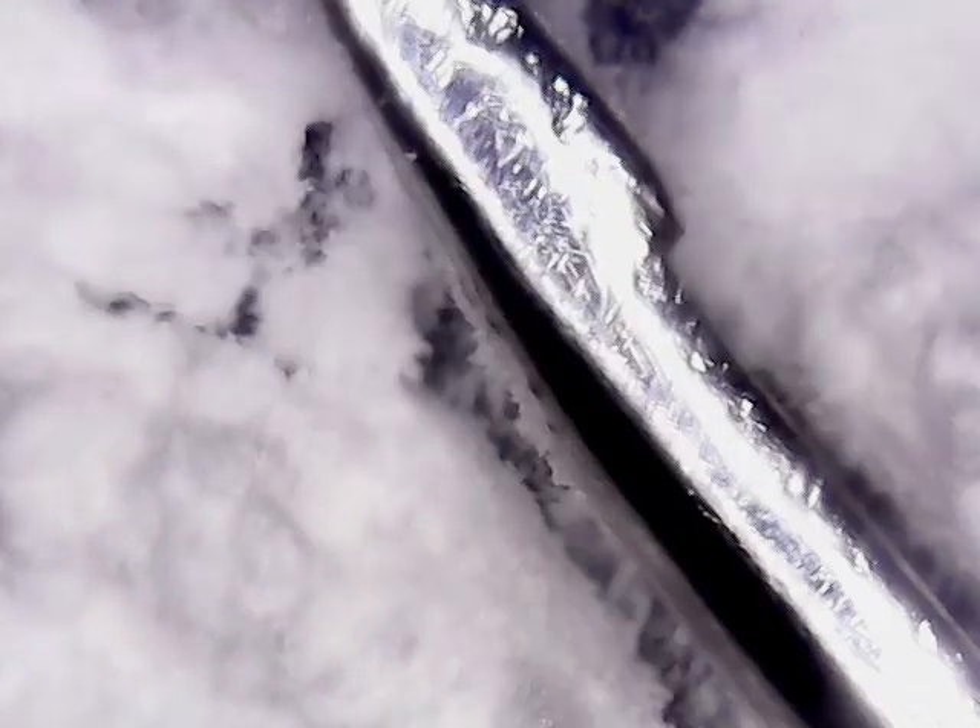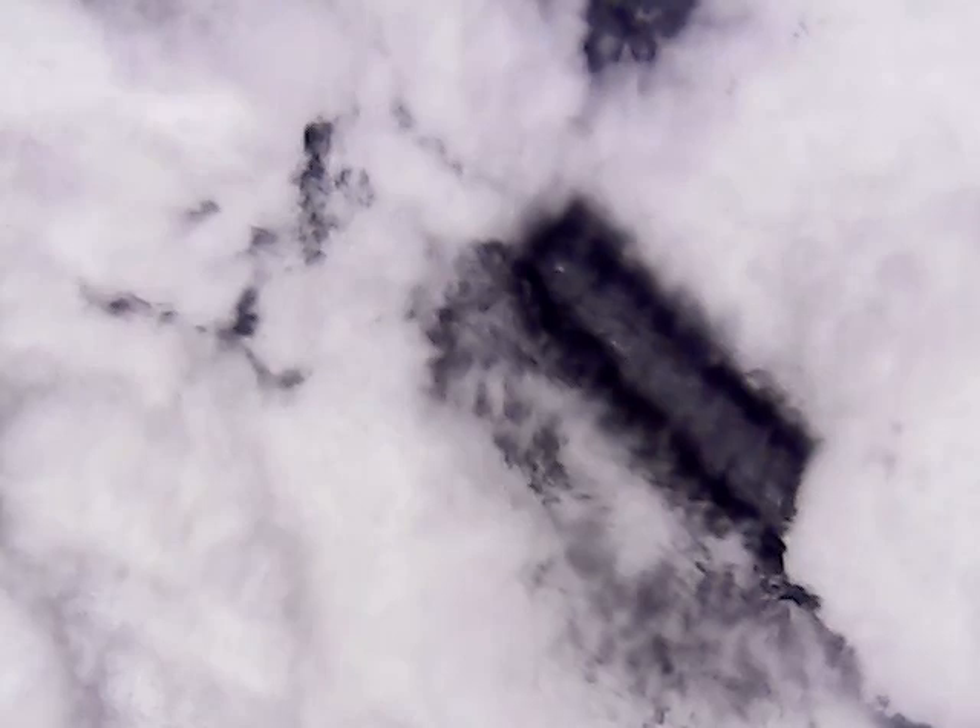It looks gross. Oh, I know why it looks gross — this is the tweezers that I used to pick up the ant. So yeah. I'm really showing the liquid absorbing power and shape containing power of cornstarch. That's interesting. You can see that.